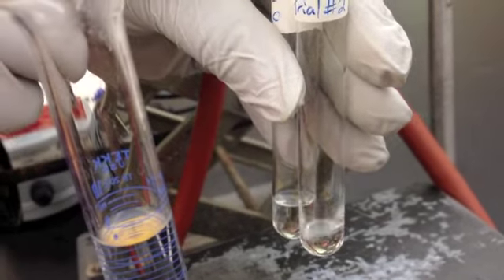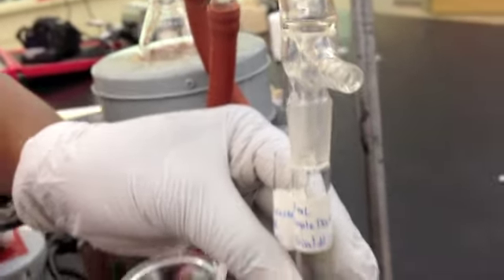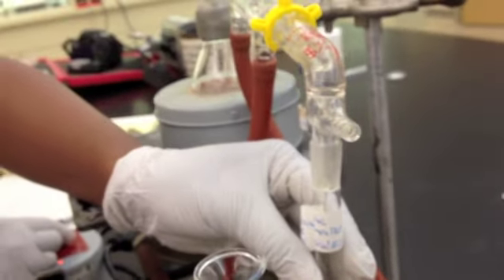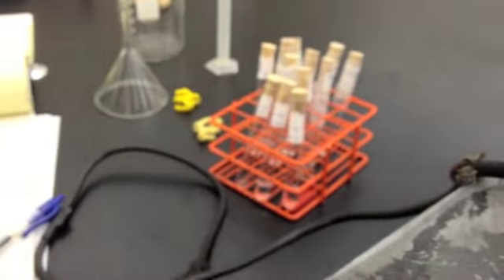Also ensure that the drop rate of your distillate is 1 drop per second. Sorry, 1 drop per second, not per minute. As you can see, I'm collecting it, and I'll measure to ensure that I have 1 milliliter. I'll empty my full graduated cylinder into a beaker and put it back. So I have my 1 milliliter, my 17th fraction, and I'll put a stopper in it, and I'm going to use it for GC, which is gas chromatography, to determine what compound was in that mixture.